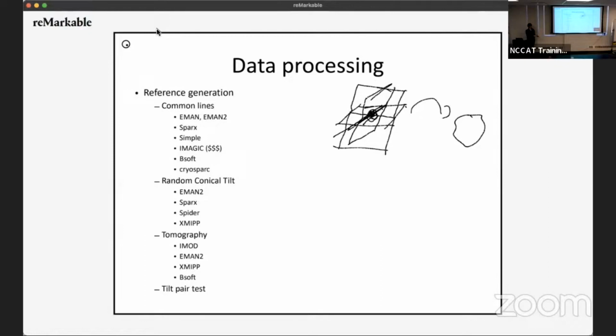Is there any quality relationship between how many particle orientations and the resolution of your 3D model, quantitatively? So, a quantitative relationship between the number of particles and final resolution, basically. That's kind of the idea, like how many orientations do you need to get high resolution? I'll get to it next slide.